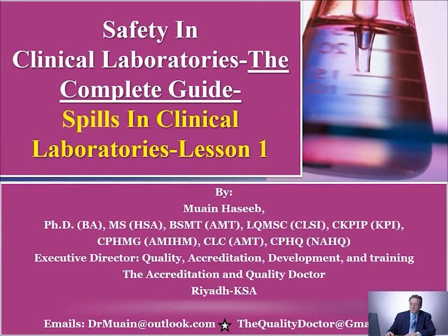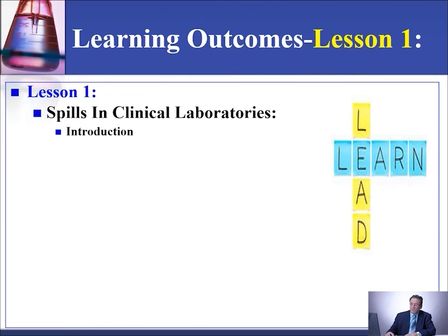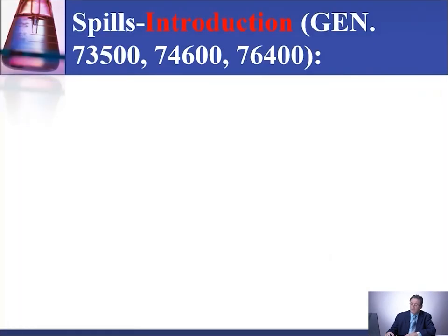This is another topic on safety: the complete guide to spills in clinical laboratories. On the subject of spills in clinical laboratories, in lesson 1 we'll give you an introduction. We'll talk about spill types based on size, spill treatment methods and kits, and what to do when a spill or accident happens. In lesson 2, we'll continue with spills in clinical laboratories, how to clean the spills, and specific situations and how to deal with them. So let's start with lesson 1.